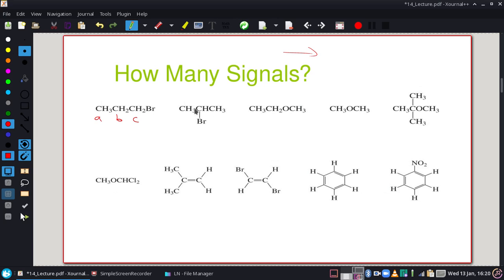All right, next one, even though it has the same molecular formula, still 3 carbons and still 7 hydrogens and a bromine, we will see a totally different structure in the spectra, because those 3 carbons and those 3 carbons are equivalent because they're almost like mirrors of itself. And this is just the only one. So while that bromopropane has 3 signals, this one only has 2.